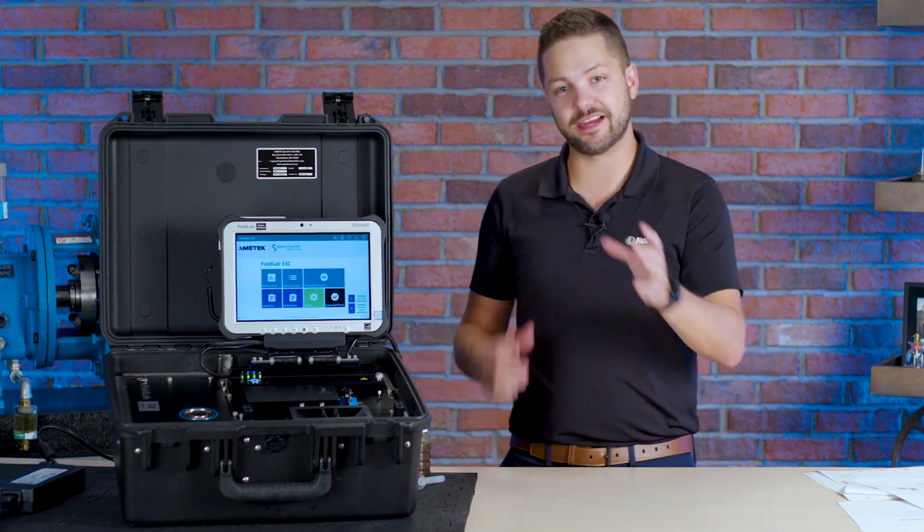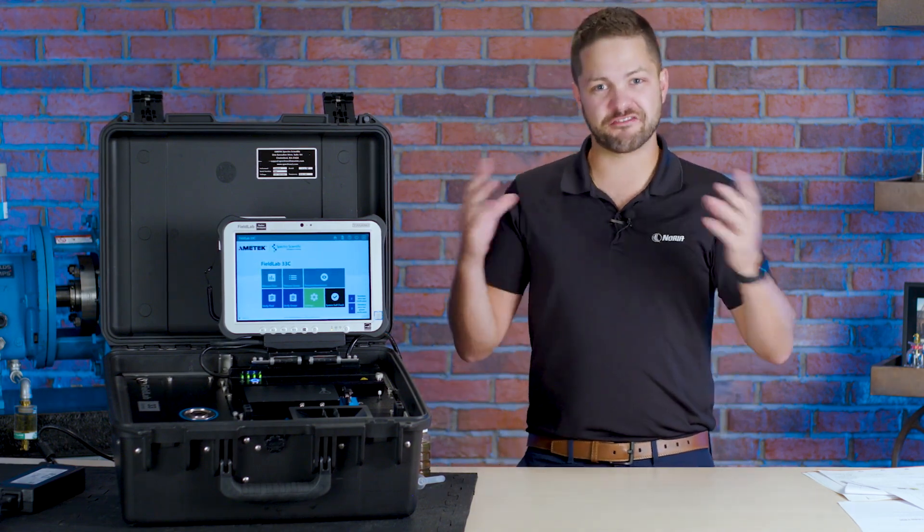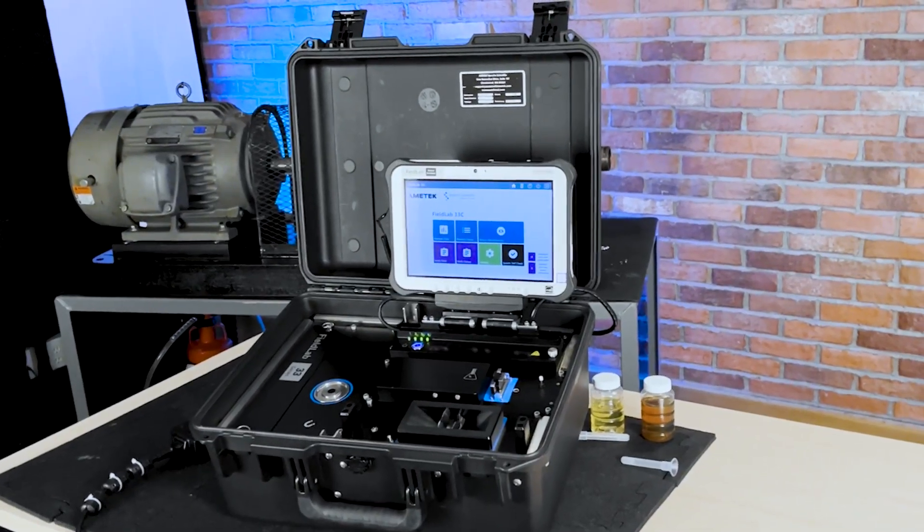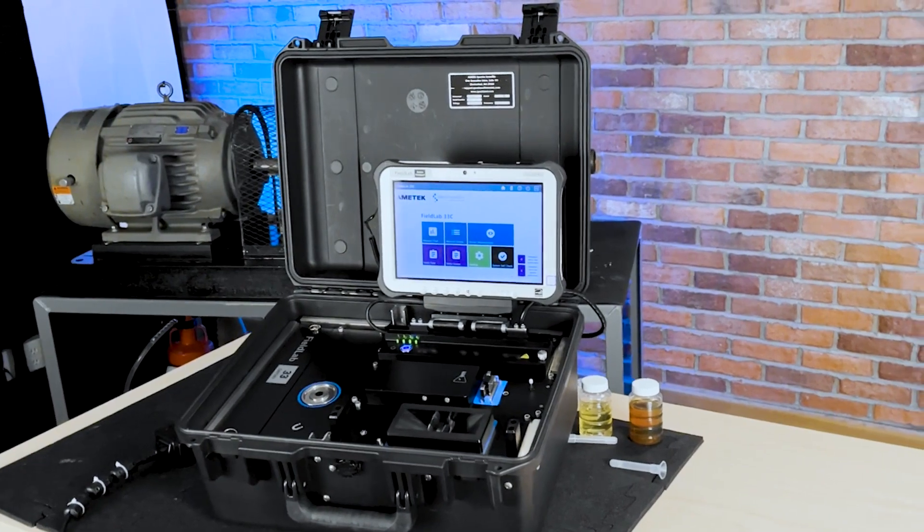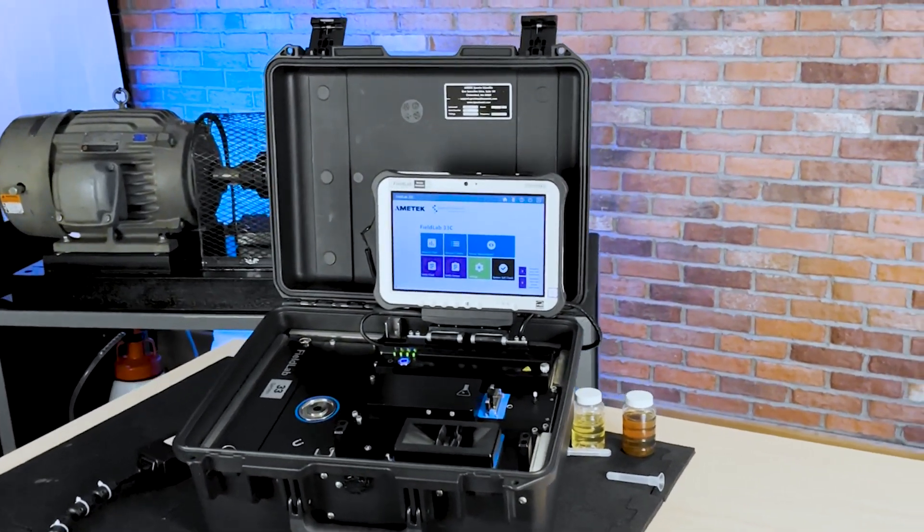That is an on-site analysis just like it says Fieldlab including a viscometer, chemistry testing, ferrous density meter, all into one device.